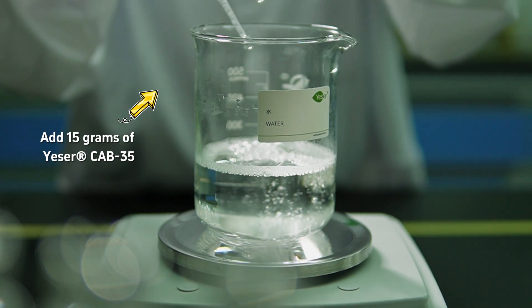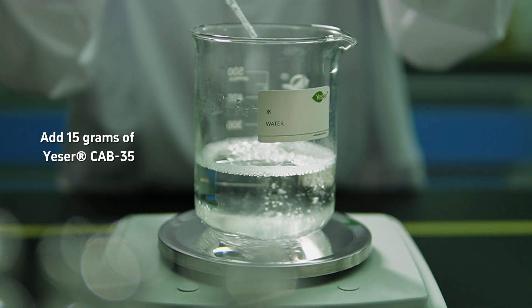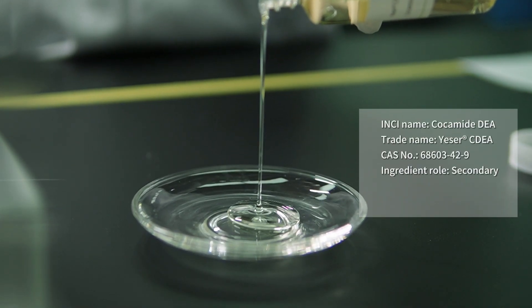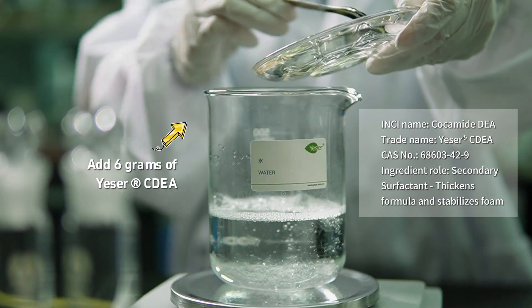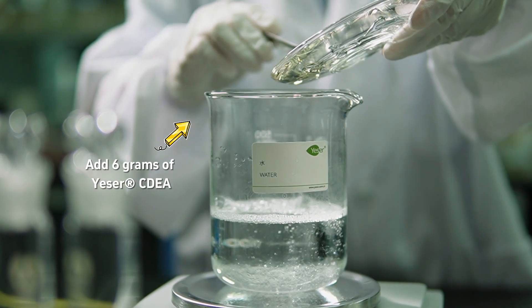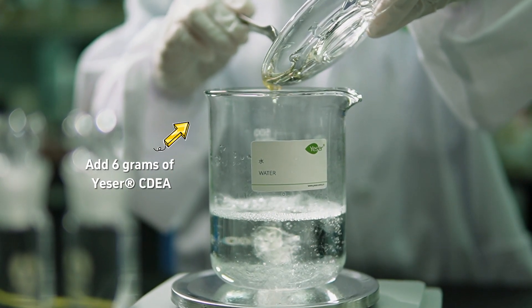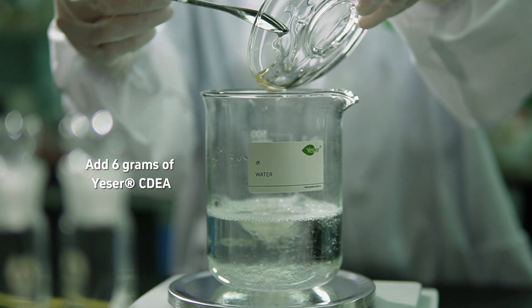For this batch, we're adding 15 grams, which is about 5% of the total. Next, we add our CDEA. This ingredient's claim to fame is enhancing viscosity and stabilizing foam. In our formula, we're adding 6 grams of it, making up 2% of the final 300-gram batch.